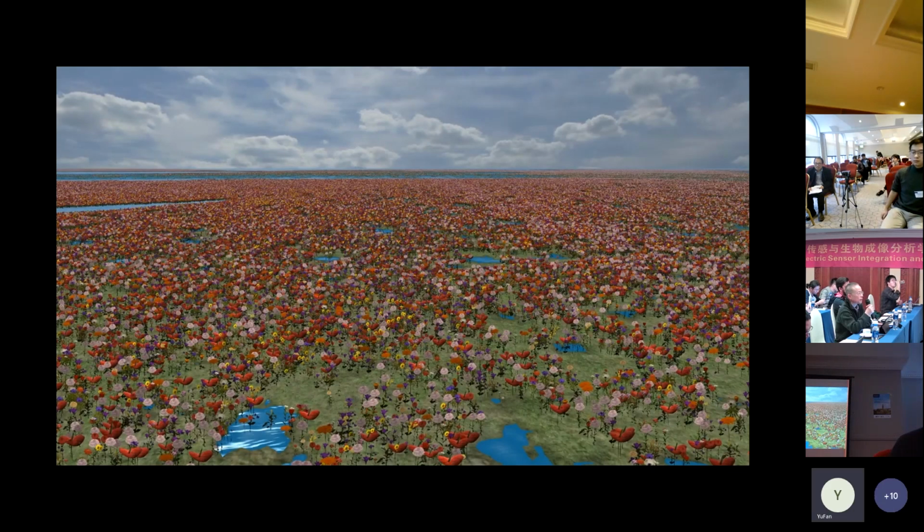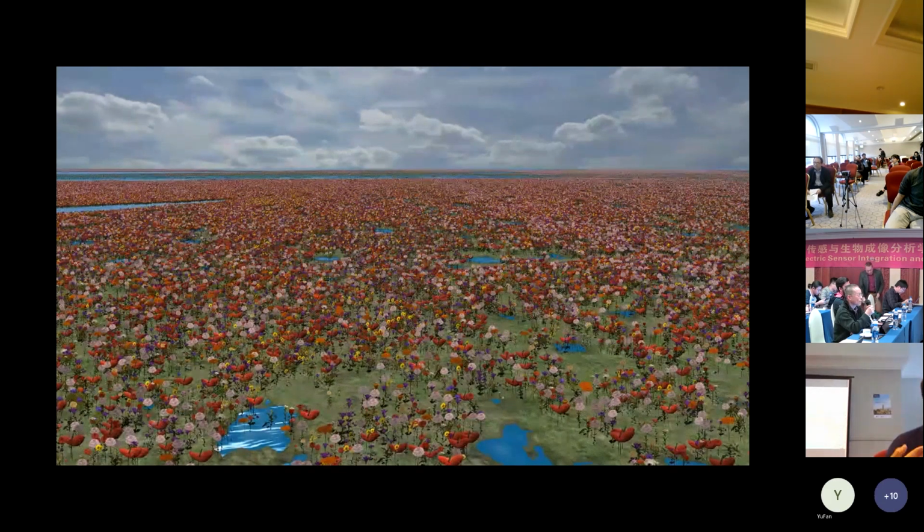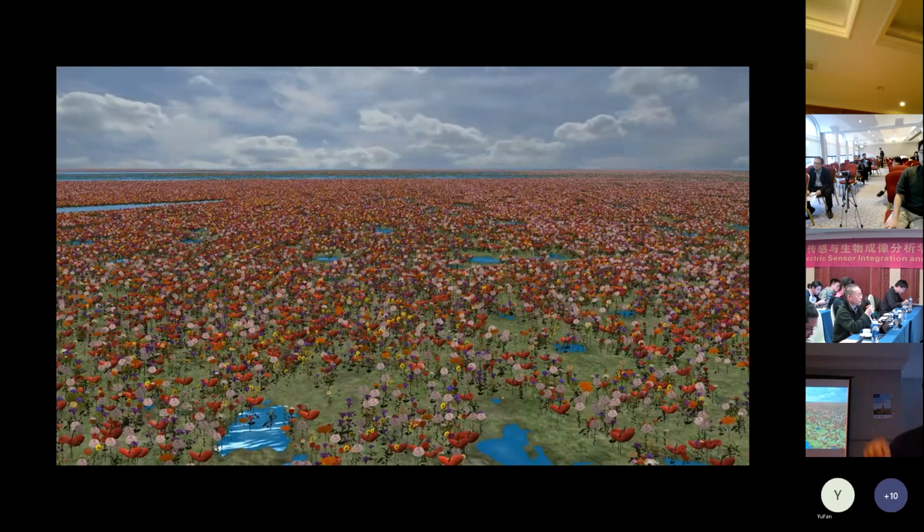Is it simulated, or is it real data taken from the brain? It's real data. The first part shows the raw images taken from the mouse brain, and the puncta, the small circles you saw, appear after the image analysis pipeline has run and identified the synaptic puncta.